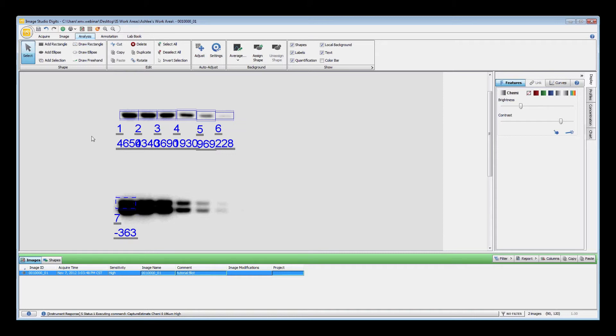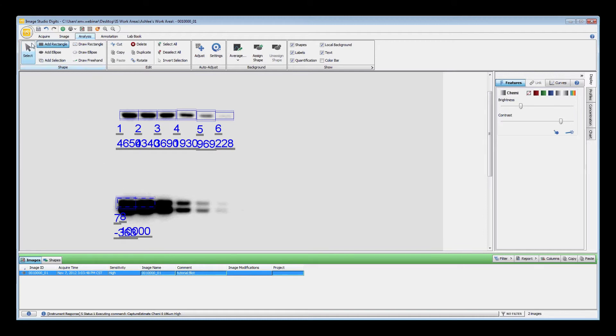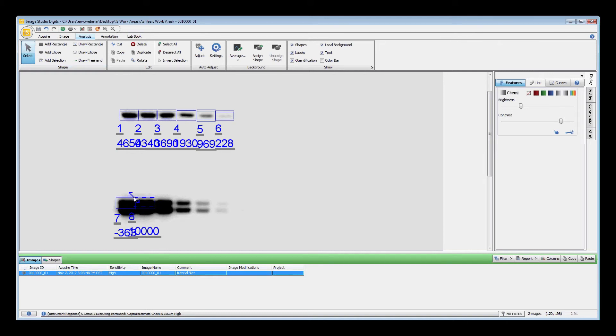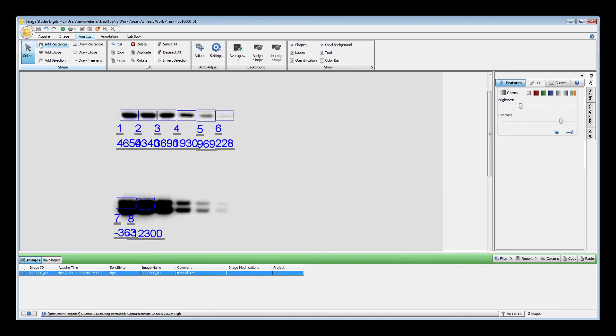When you are ready to add another shape, you will need to click the Add Rectangle button again. Continue clicking, resizing, and repositioning until you have added rectangles to all the signal you are interested in. Then click Select, or press the Escape key on your keyboard to return the cursor to the Selection tool.